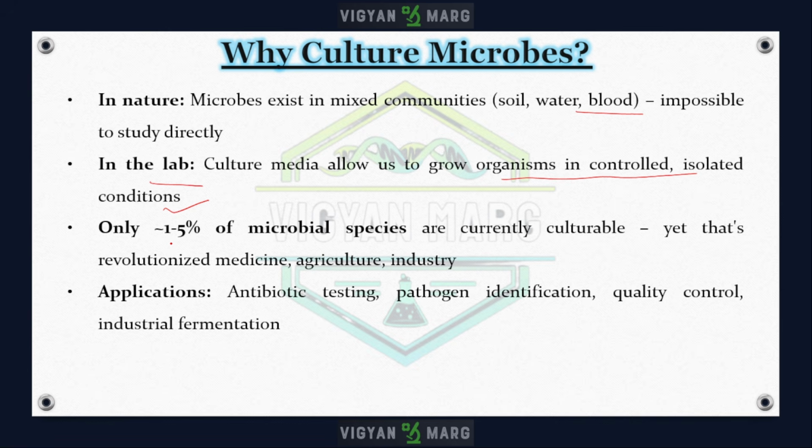Even though only about 1 to 5% of microbial species are currently culturable on standard media, that small fraction includes nearly all medically important pathogens and microbes used in industry. Applications of culture include antibiotic testing, pathogen identification, quality control, and different industrial fermentation processes.